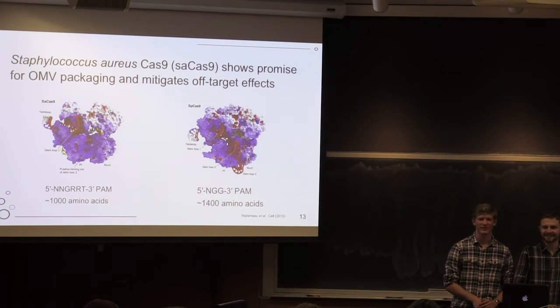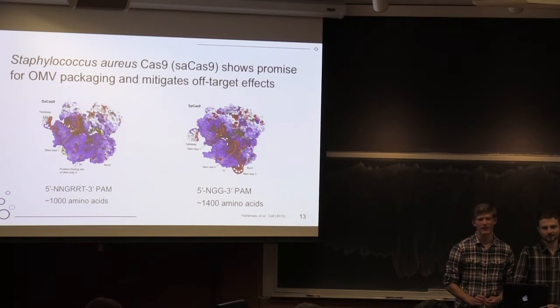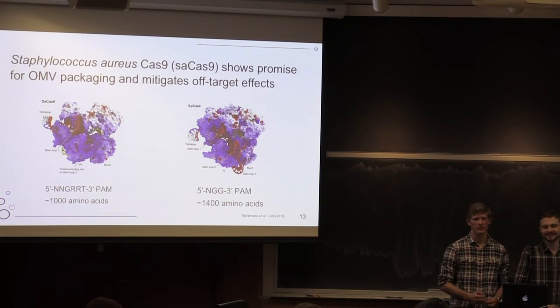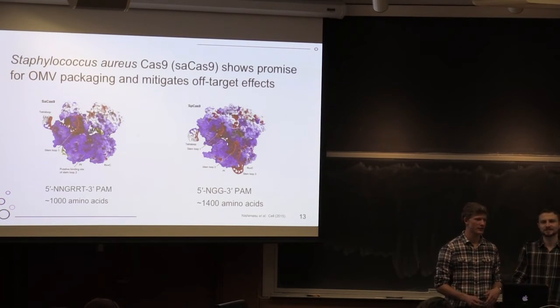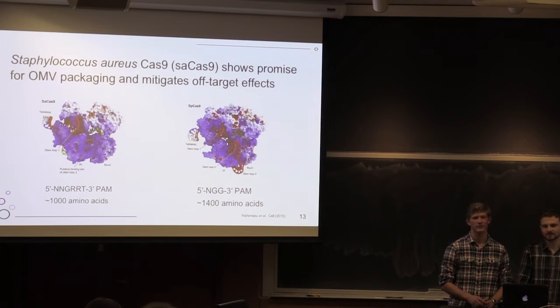How do you purify it and keep it intact, if you were going to deliver it? Different teams use different methods. The most effective one that we've seen is ultracentrifugation, which we didn't really have available. So one of our collaboration projects used a procedure developed by a team in Australia that just used 100 kDa filters. They spun the vesicles down in the filters and concentrated them. That's what we ran as well.